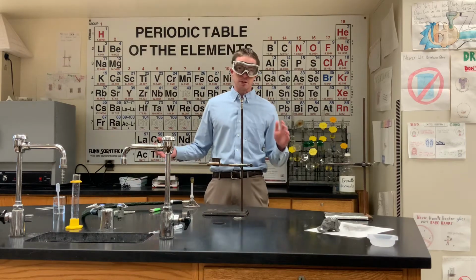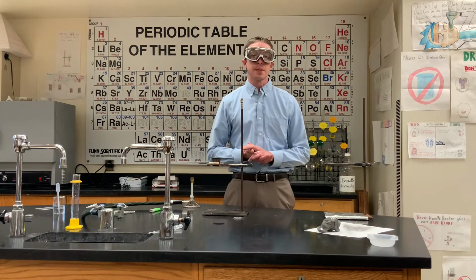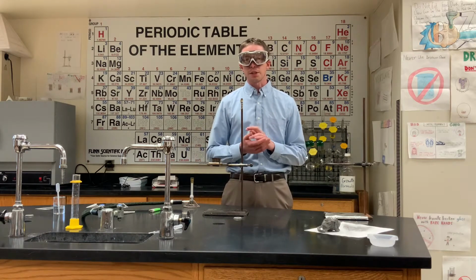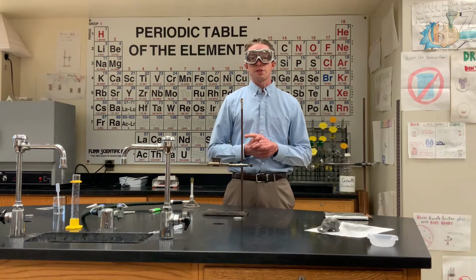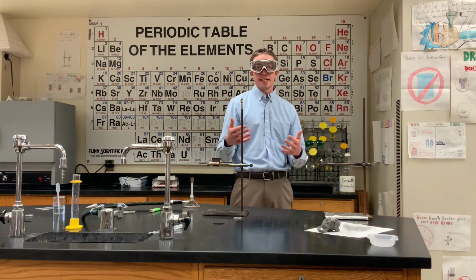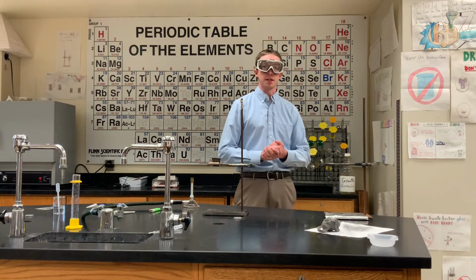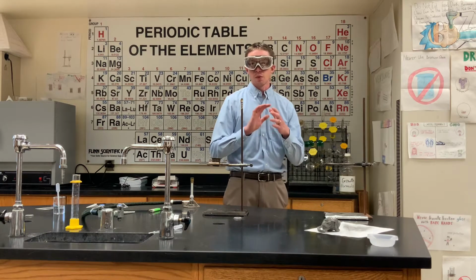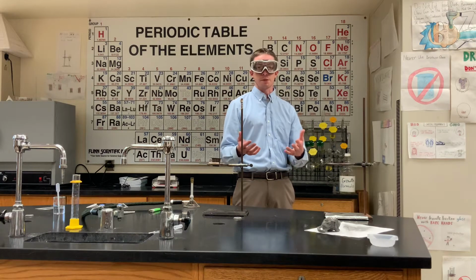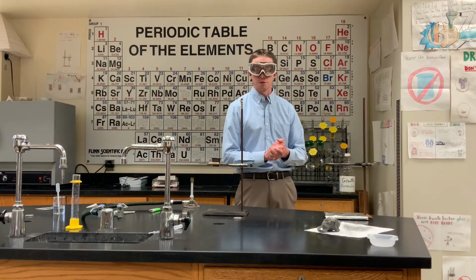All right, everybody, so here we are. We're about to take on the magnesium oxide lab. There's a couple different variations on this. We are going to use it to kick off our nomenclature unit, and we are going to show you basically through this lab, and if you're doing the lab, you'll experience it, how we derive some of the first chemical formulas experimentally. And then the rest of the stuff that we do in this unit will kind of be like making use of all those hundreds of years of chemistry research so you don't have to experimentally determine every single formula you're going to use.